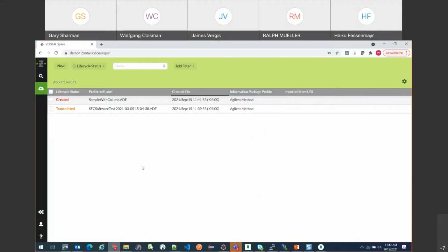So the first thing in the workflow would be, and we see that Heiko is just working with the system here, awesome. The first step in the workflow will be to create a request for measurement.